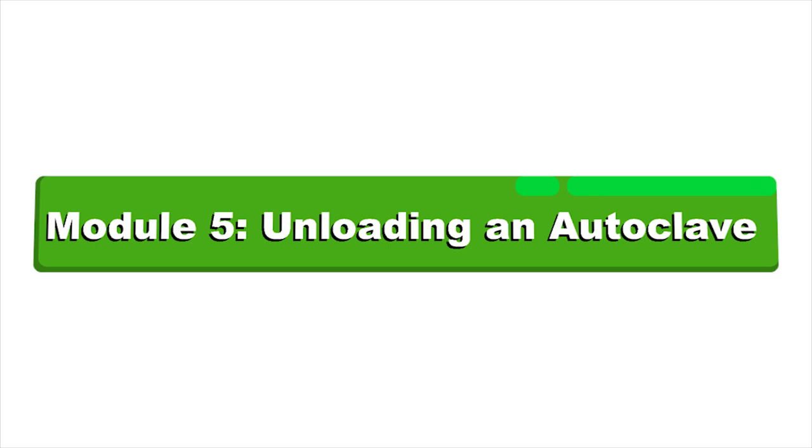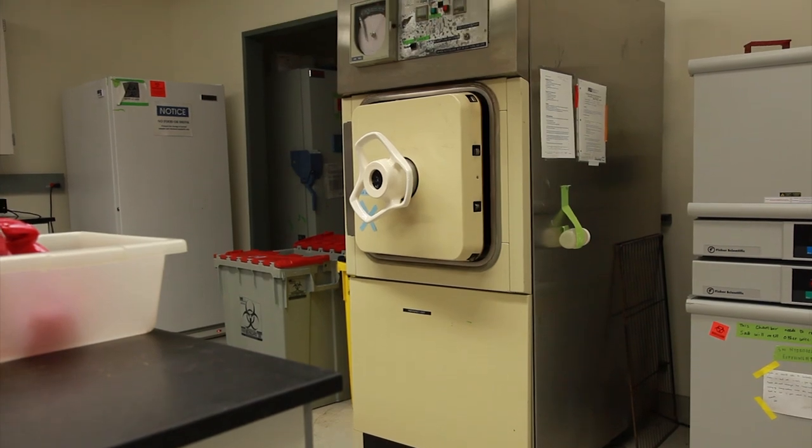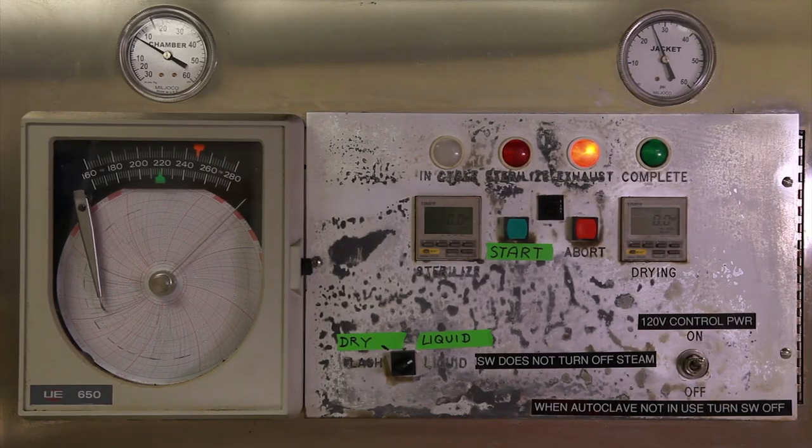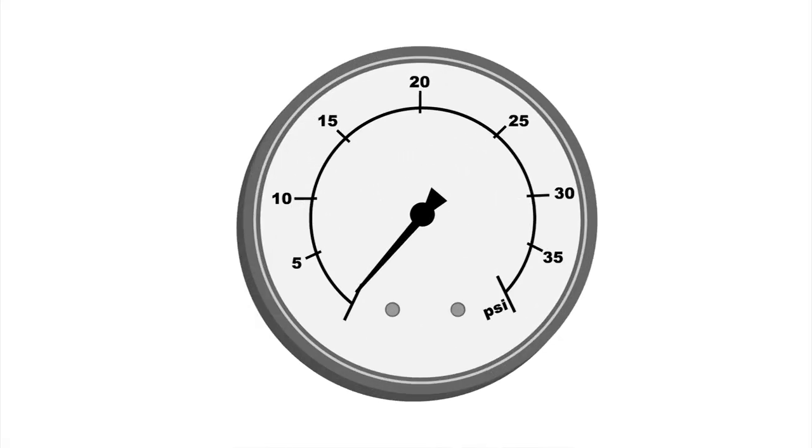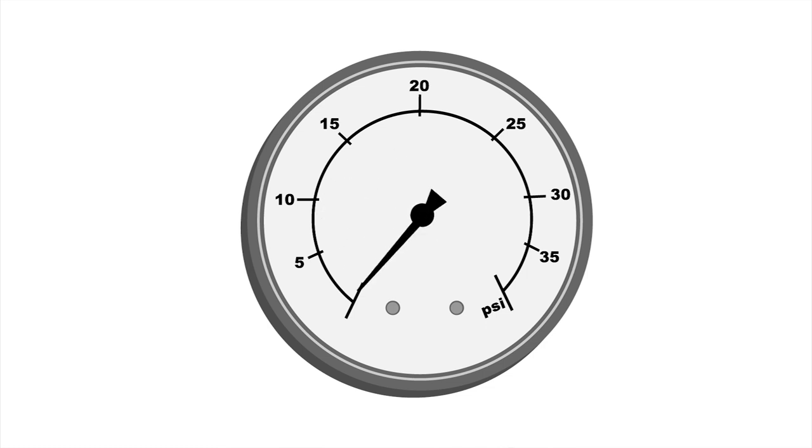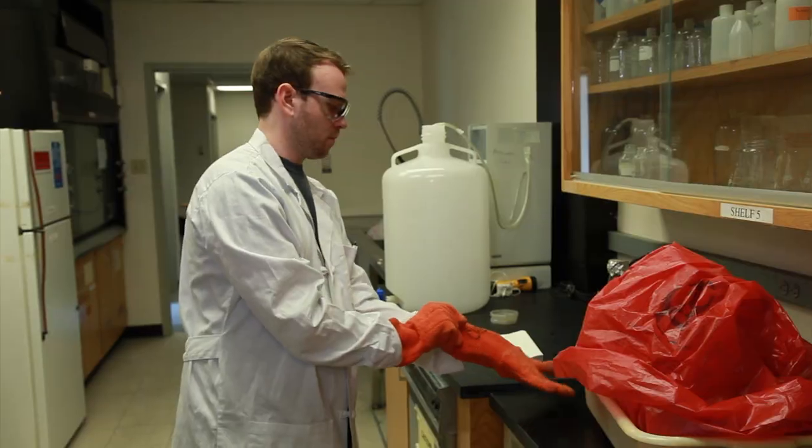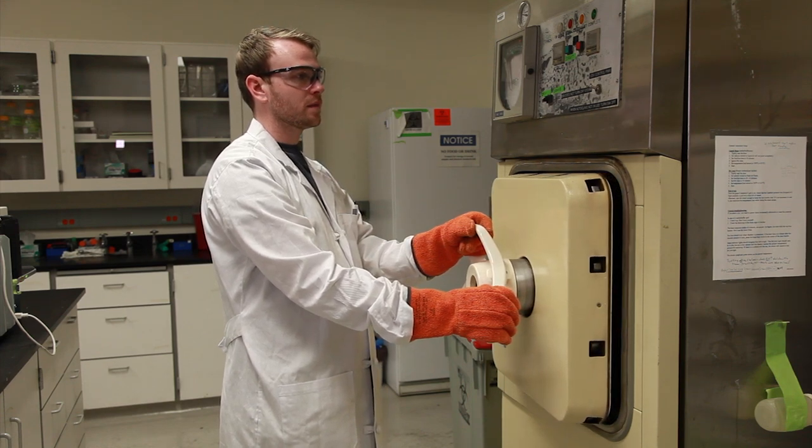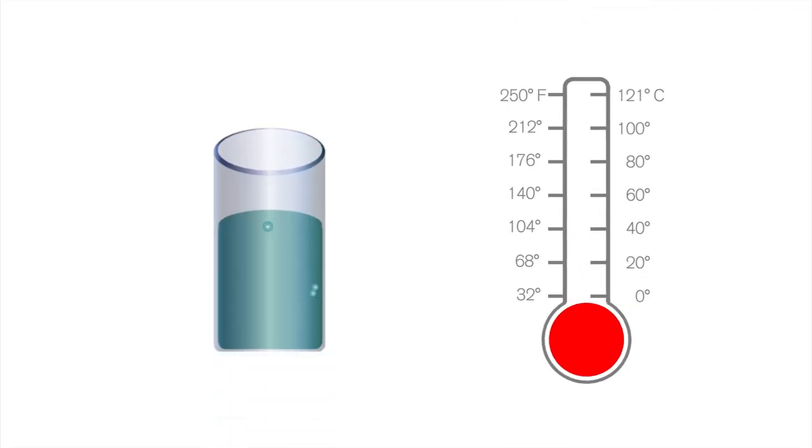Module 5, Unloading an autoclave. The time when most injuries occur in regards to the autoclave is when it is being unloaded. In older units, this is because the interior chamber is still slightly pressurized and pressurized steam is hotter than boiling water. The rush of steam escaping often catches users off-guards, sometimes causing burns and may impair vision. To be safe, follow these steps. Ensure that the cycle has completed and both the temperature and pressure have returned to safe range. Look for the chamber pressure to be back at zero. Wearing PPE and with your body and head as far away from the door as possible, slowly begin opening the door, no more than one inch. This will release residual steam and allow pressure within the liquids and containers to normalize. Remember, pressurized steam is hotter than boiling water. The heat of vaporization released upon the condensation of steam causes much severer damage than does the same quantity of boiling water.